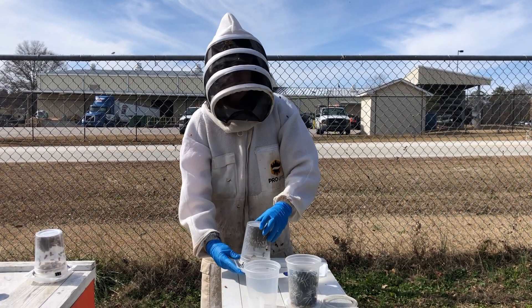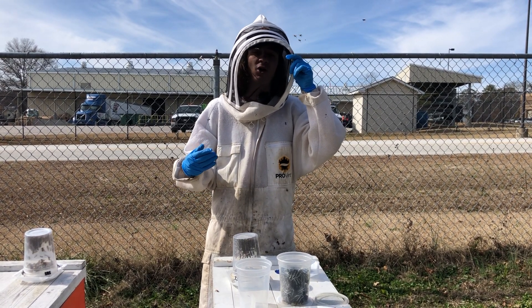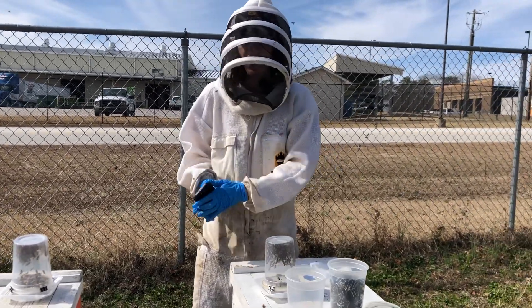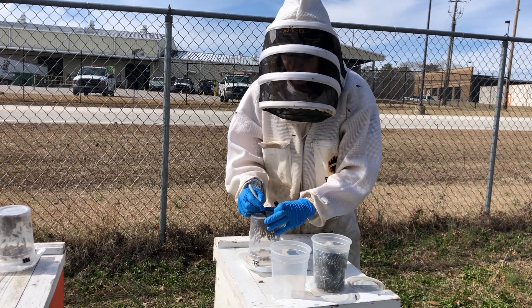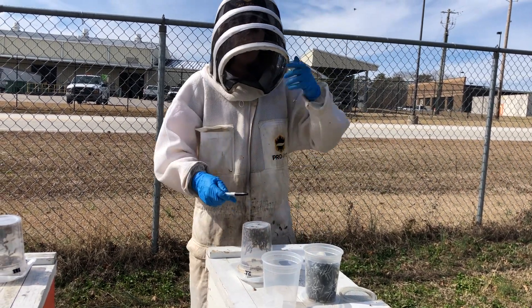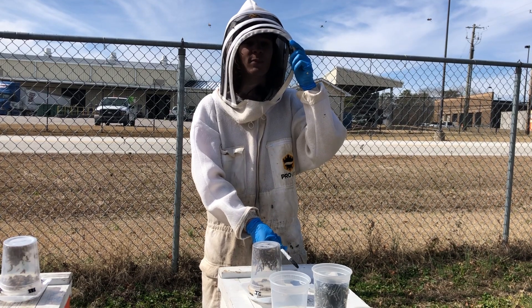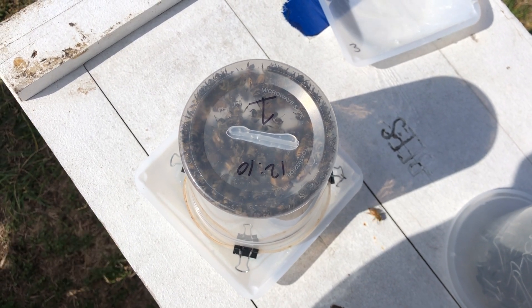After the three hours, the cups will be flipped back over and we're going to do an alcohol wash. Any mites we find in the alcohol wash are going to be considered Amitraz resistant. I like to check my time on the clock — it's just past 12 — and write down the time that we flipped the cup. I also put the colony number, so this allows me to keep track of the three hours and which cup came from which colony. You'll also notice that I numbered the weigh boat as well.